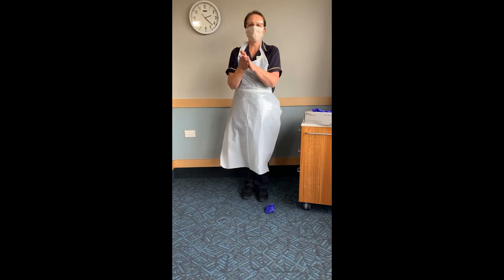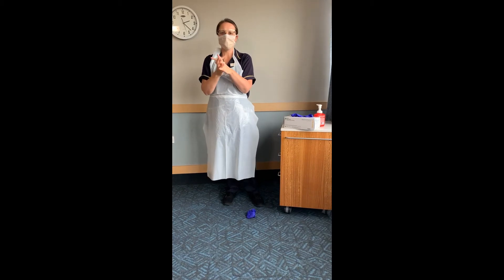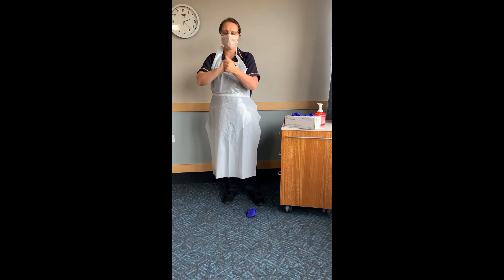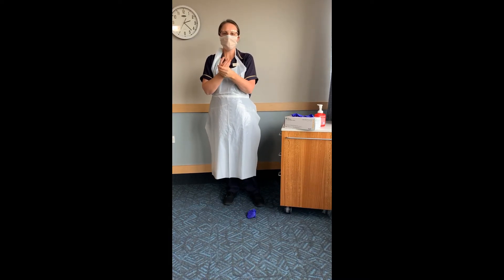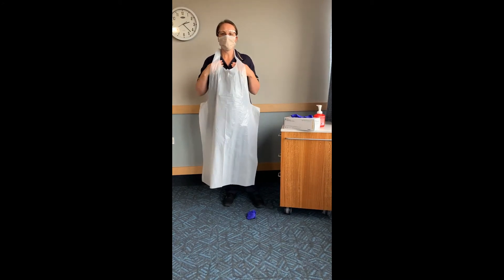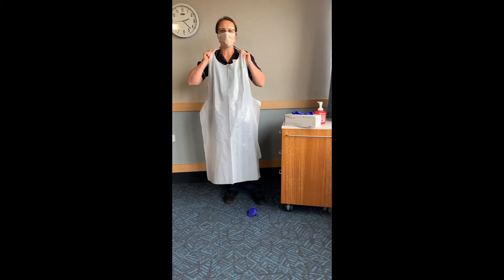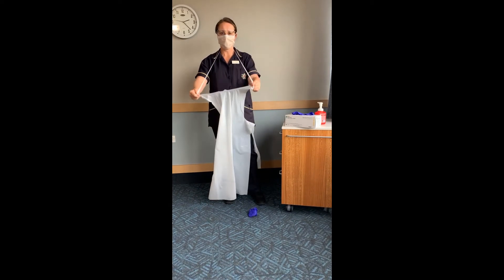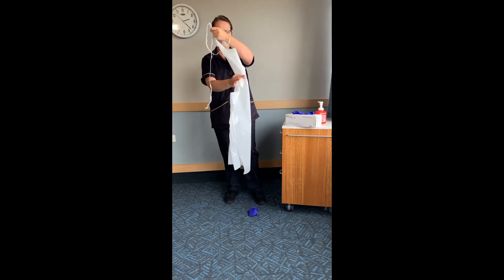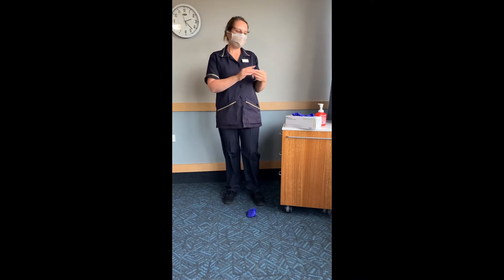Perform hand hygiene. Untie your apron at the back, being careful not to come in contact with the front. Go up to the top, rip your apron so that you can pull it off carefully, making sure that you only touch the inside of the apron as you put it in the bin. Perform hand hygiene.